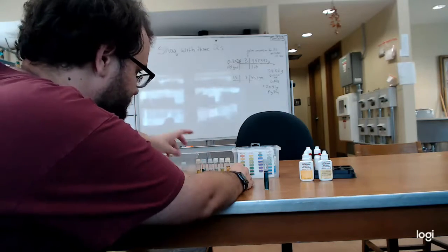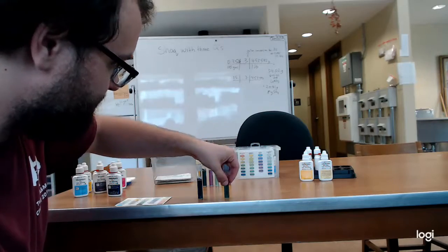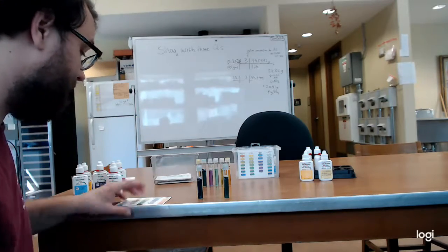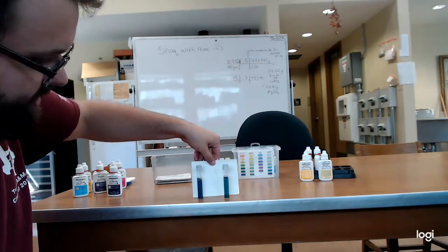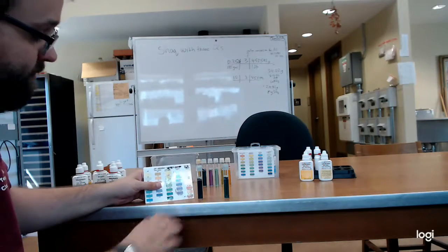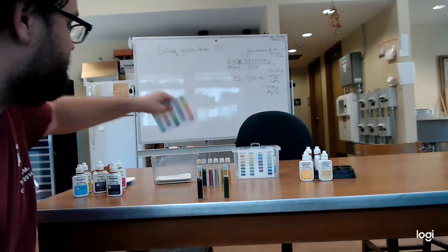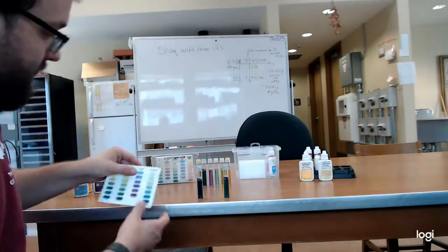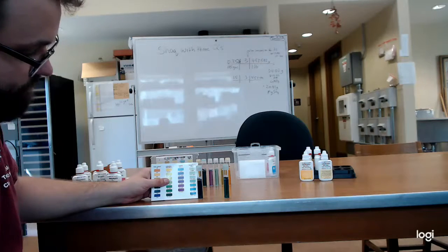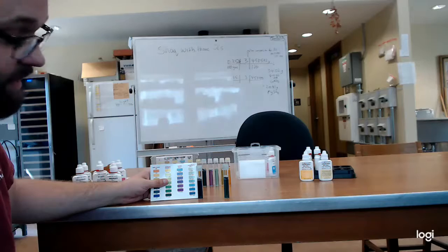And finally, we will go on to one of my favorite chemicals, and the one that is being mined at the fastest rate currently, phosphate. I'll try and put a card back here so you can see there is a slight color difference here as well. So again, with the nutrient solution that we have, it is almost entirely, oh, this is the wrong card. It is over 10 parts per million. We don't really know because we're at the top end of the spectrum there.